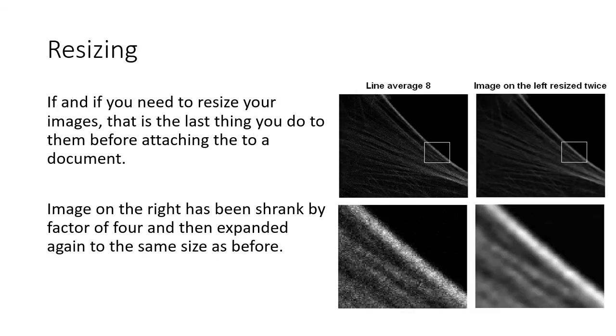If you have to resize your images, it is the last thing you do to them before you attach them into anything. The problem is that resizing works as a smoothing filter. So here on the left we have a genuine picture taken with average 8, and then we have shrunk it, and then we have expanded it, and it does not look anything at all like the picture where it came from. So don't do this.